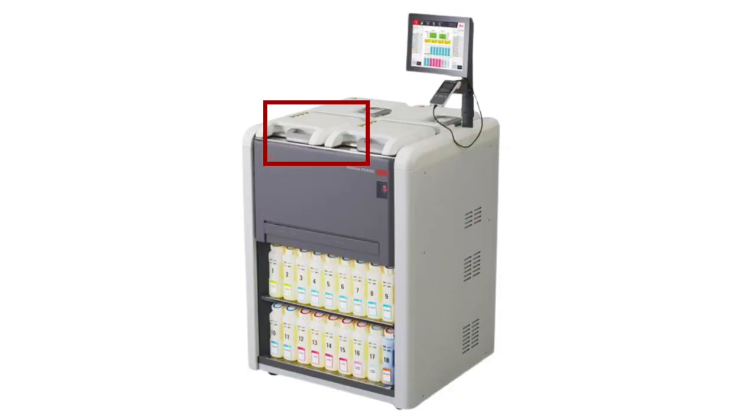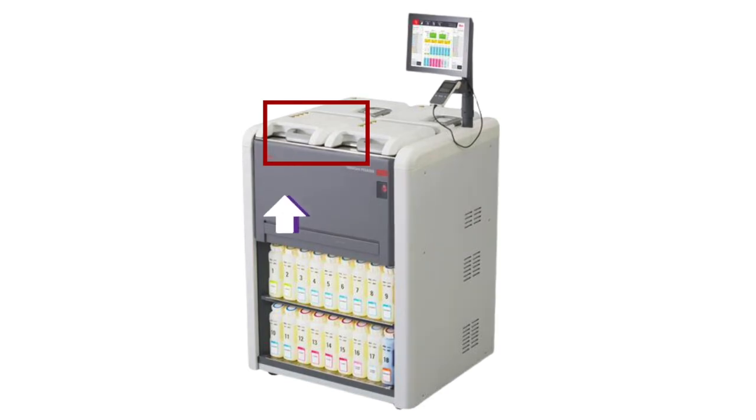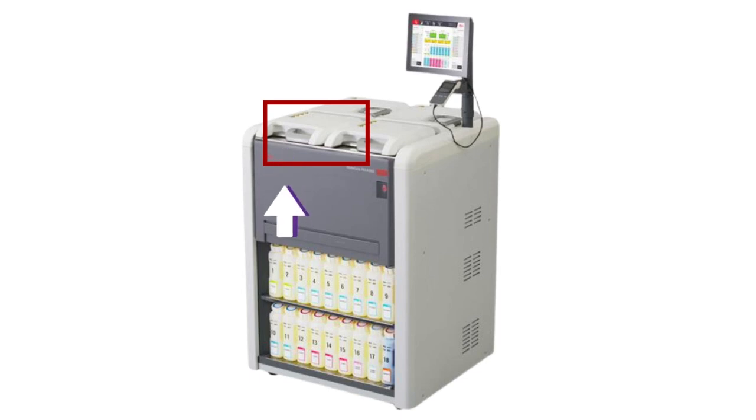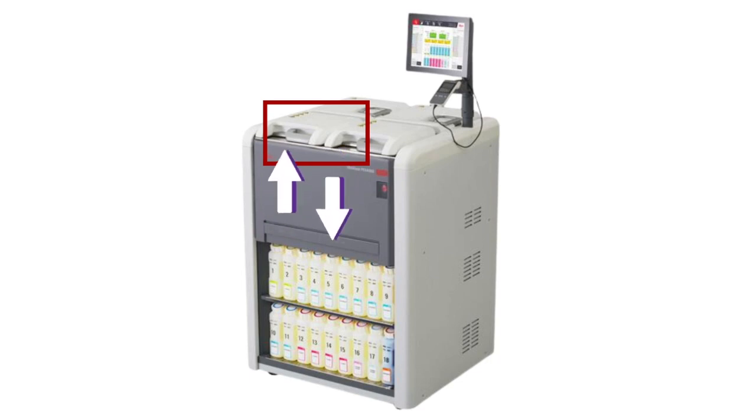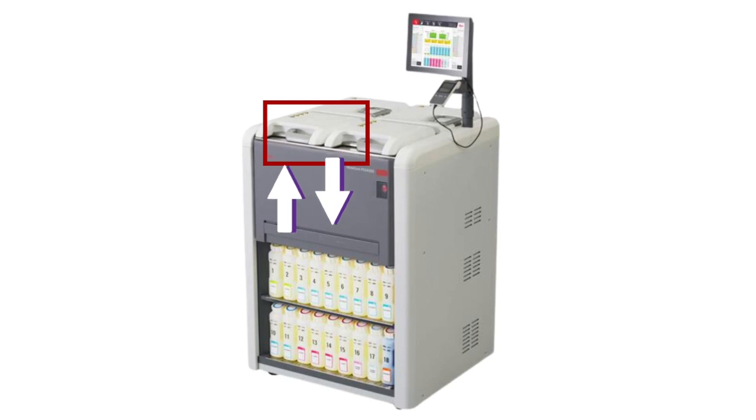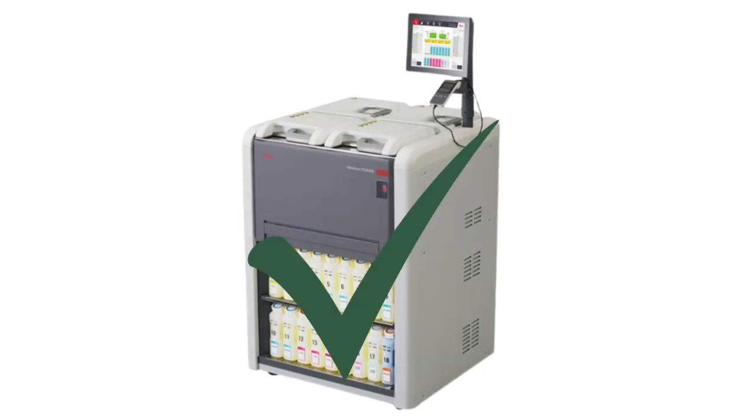The tissue processor works like this. First, put your cassettes into one of the retorts. Depending on the protocol you select, the processor will pump the reagent into the retort and process the specimen. When this is complete, the processor will pump this reagent out and pump in another one. This will continue until the whole process is finished.